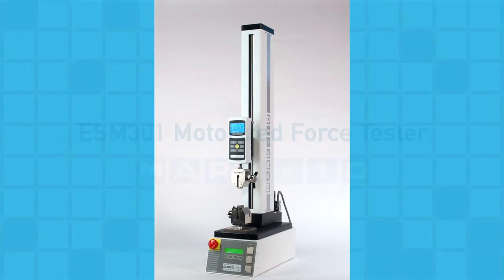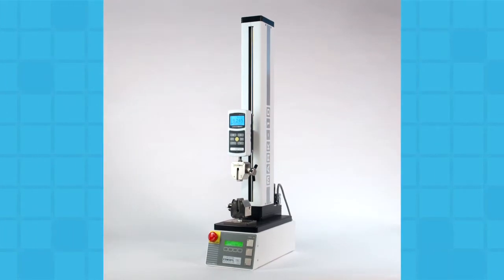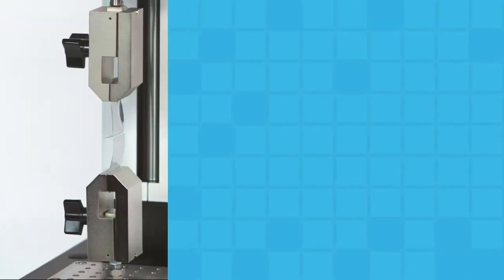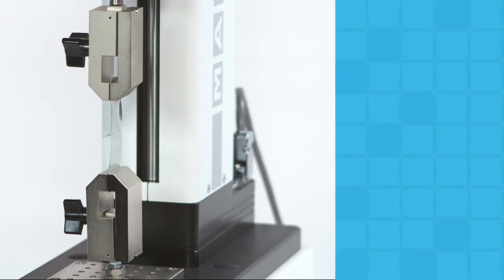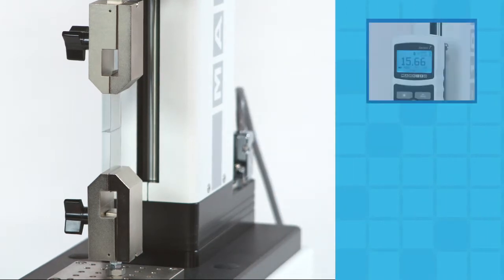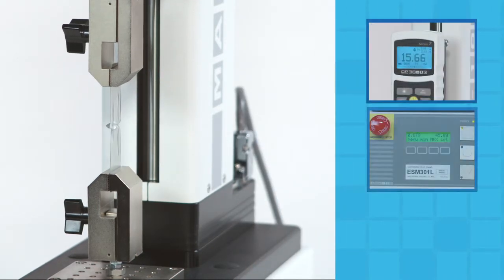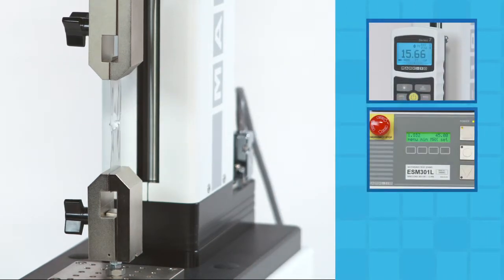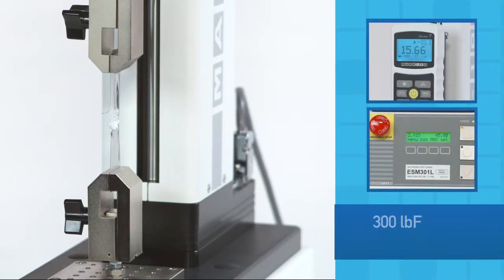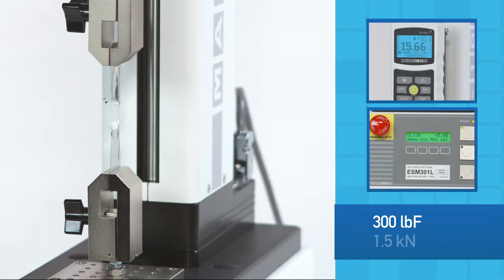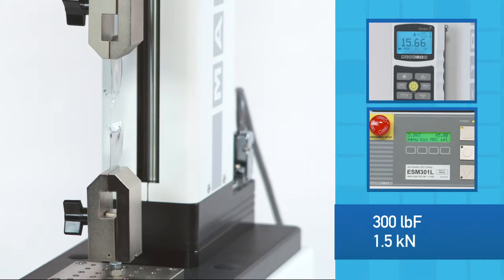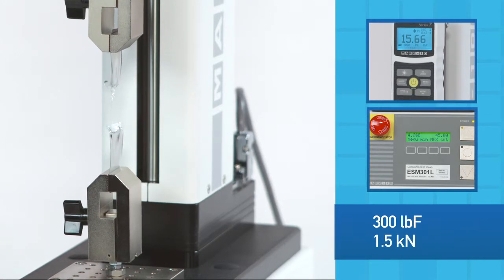Welcome to the Mark 10 ESM 301 Motorized Test Stand. The ESM 301 satisfies tension and compression testing applications up to 300 pounds or 1.5 kN of force.